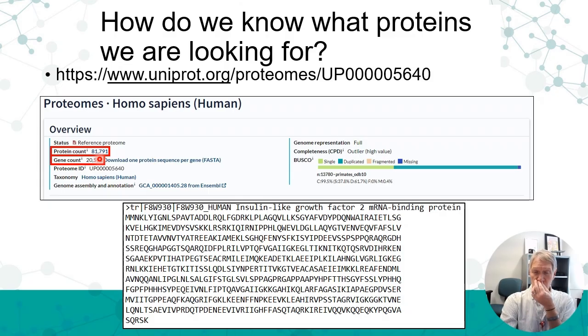So this is what one of the entries looks like. The library is actually a bunch of these entries that tell you a specific protein number, a little description of what that protein is, and then the primary sequence of that protein. And so the computer's job is to identify from the MS2 signal what the sequence is of the peptide, then take that sequence and go to our library and see which one it matches with.